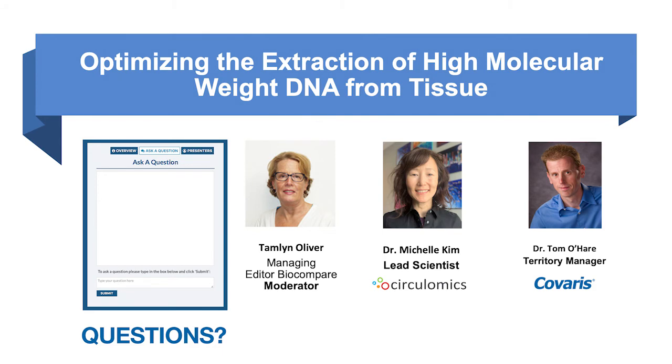Oh, sure. It entirely depends on what solution you're using for bead beating. If you're bead beating in a solution that is lysing your cells open, that's probably not going to be good because that's going to end up shearing your DNA. If you're bead beating in, say, for example, PBS, then that should not lyse open your cells.